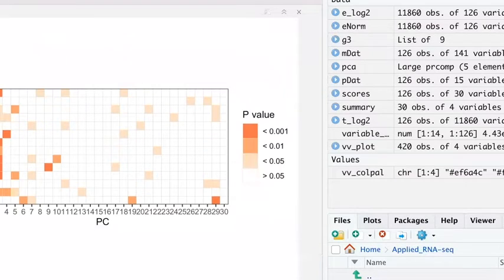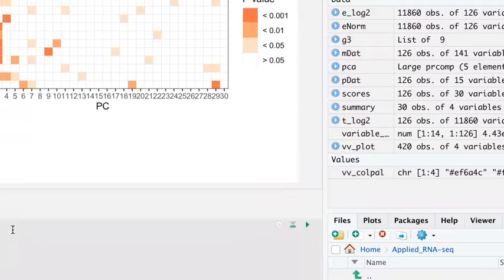So we see that the score Apache 2, I don't know how to pronounce that, COVID also seems to be contributing very highly, as well as ICU, mechanical ventilation, but basically all the ones which have orange in them, meaning that they have a p-value of less than 0.05. And if that is your p-value cut off, then those are the significant variables.